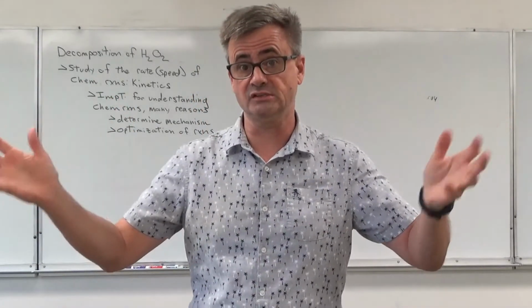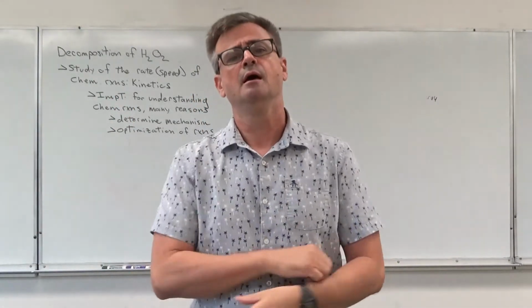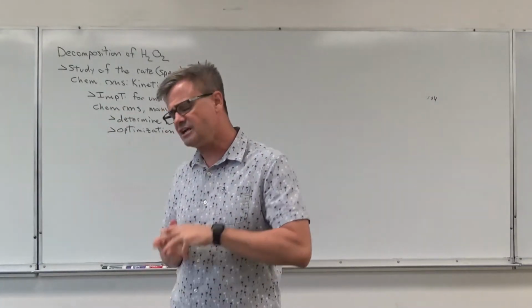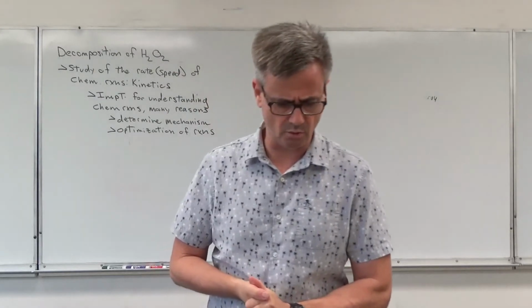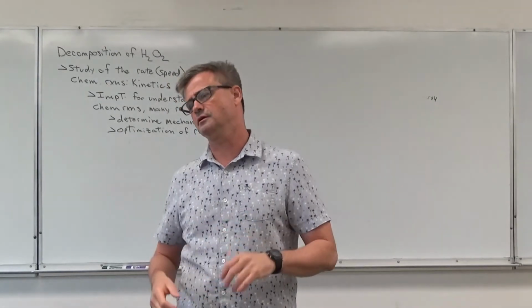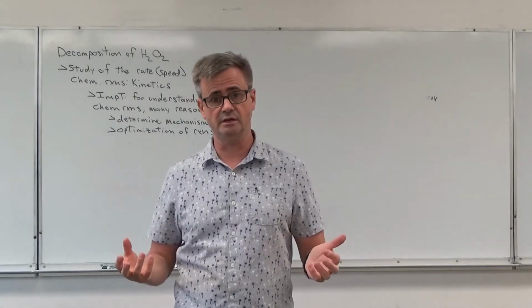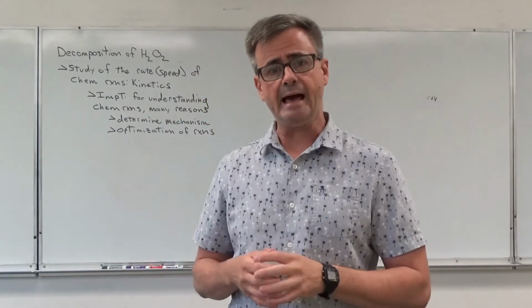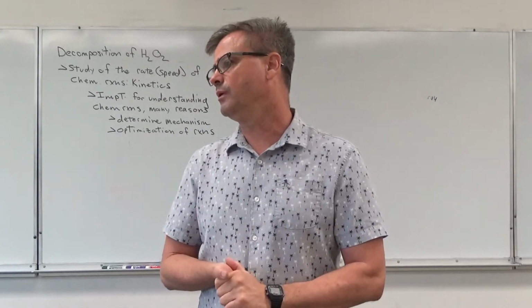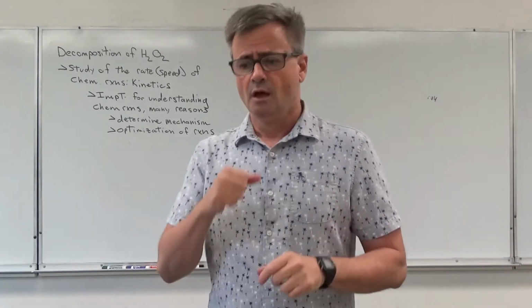It could be very, very slow. We just know it's happening at twice the rate. Or it could be very, very fast. So that's relative rate equations. And we're going to use the general principle of relative rate equations in this lab. We don't use it really directly, but we're going to use it indirectly.